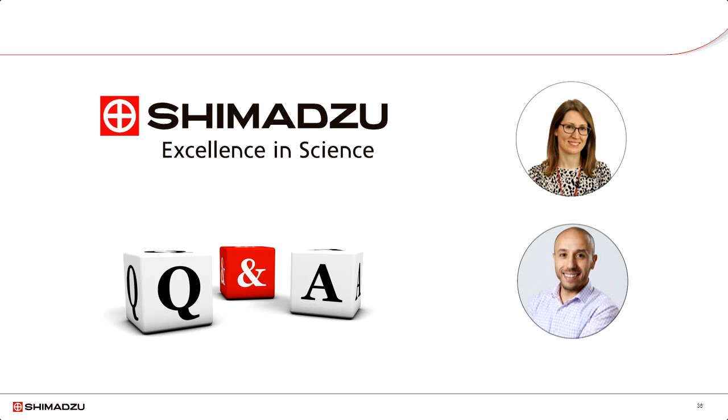Oh yes, definitely. And I like the question because I believe that our audience, especially if they're specialized in food testing, a lot of them have come across MALDI-TOF through the use of microbial identification, and I believe that what we're showing here is another dimension to MALDI-TOF that would be very helpful to them.